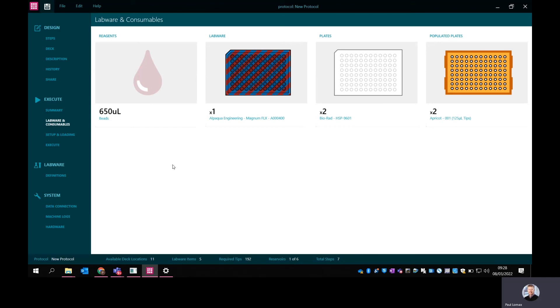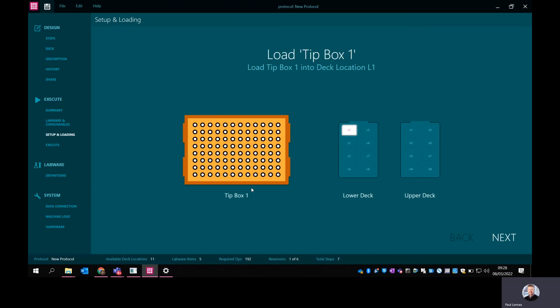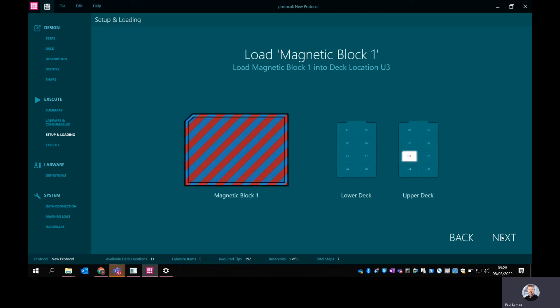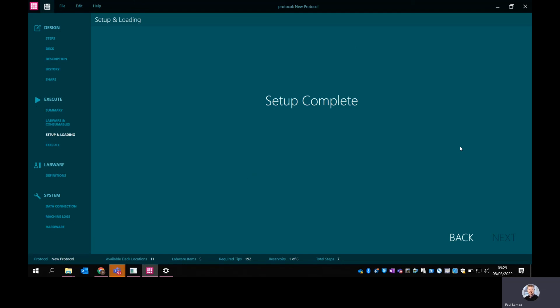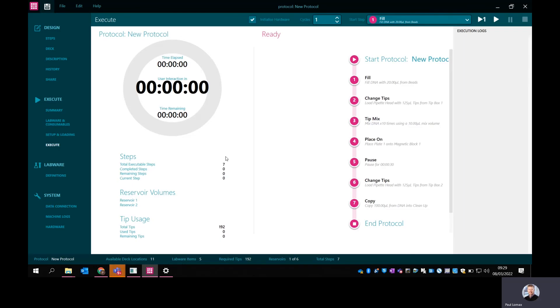Then when you actually come to the instrument to set it up, there's a setup and loading sequence. This just takes you step by step through what needs to go where. In this case, tip box one is going in position L1 on the lower deck, and you can just click through this - next tip box, first plate, magnetic block, and the panel plate, and then what you need in the reservoirs. And that's it, the setup is complete. At that point, you're actually ready to run the protocol and you would select execute. The play button at the top right would be how you start this running. As I mentioned, I'm not connected to a machine at the moment, so I'm not going to do that. But you've got all your steps clearly visible. You've got your time elapsed and the time remaining, which will be populated when you run this. You also have this execution log on the right hand side. As you run the protocol, it will build up a log of everything that's happened as you go.